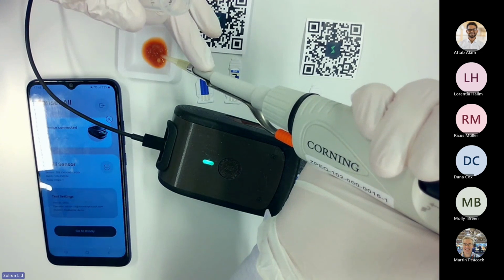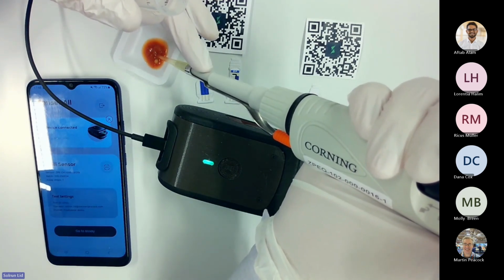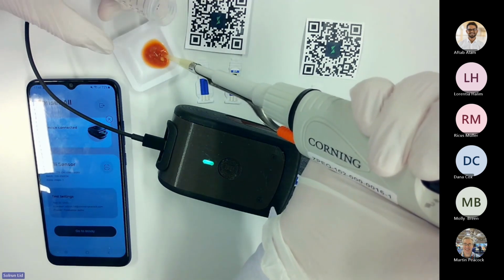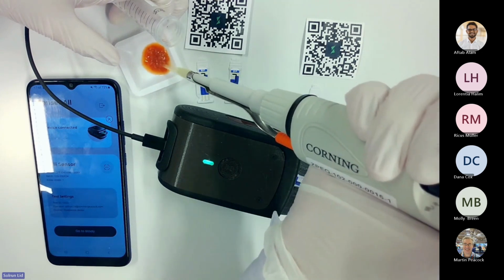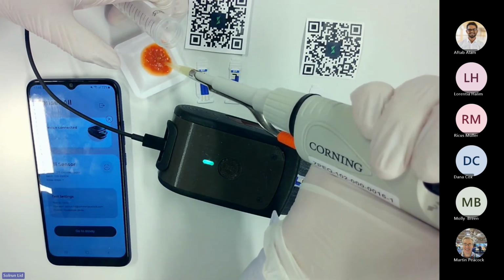And now I do a lot of talking as well, so some time is wasted on that, but right. Just give me a sec. As you can see, this sample is very chunky, and the more homogeneous you can make the solutions, the better. So just like that.